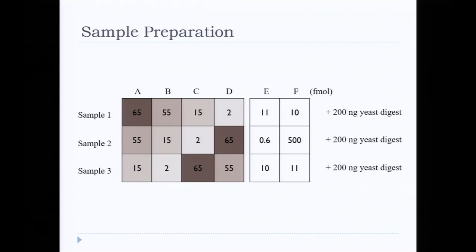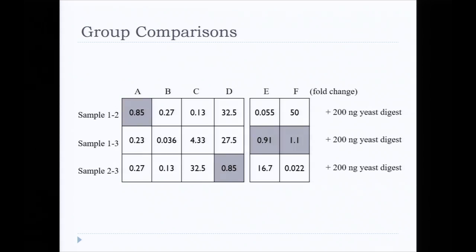So this was the sample prep they did. These are the proteins along the top, and then there are three different sample preps that they used. I think collected in triplicate, so we're going to have 9 runs to be looking at, and they had different femtomol levels for each protein in each sample, and you can see how they varied them here to keep the protein amount constant. And then now we can also derive from that.